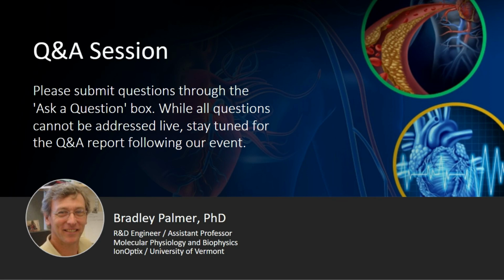Perfect. Okay, our next question asks, how quickly should an investigator aim to clip and mount the freshly produced slices? Since they're no longer being actively oxygenated, I assume this must be done relatively quickly. That's a great question, because I didn't mention that during the video I sometimes would discontinue oxygenating just for the sake of having a really good video and being able to visualize what's happening there.